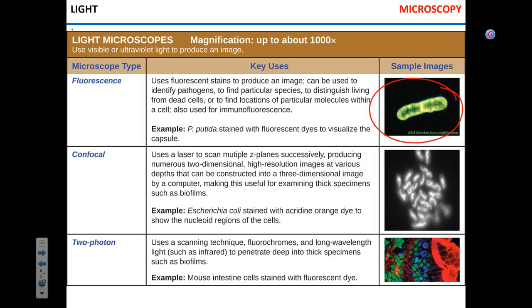That's the same idea. In response to that UV light, the specimen can start to fluoresce by itself, or sometimes scientists may use special dyes, special reagents to turn the specimen into being fluorescent.